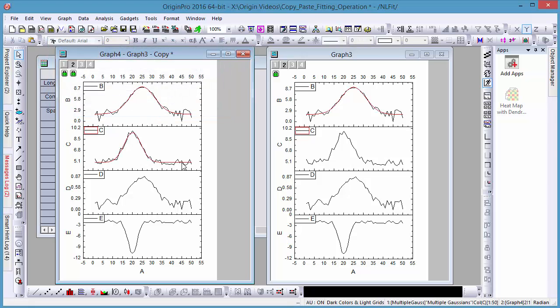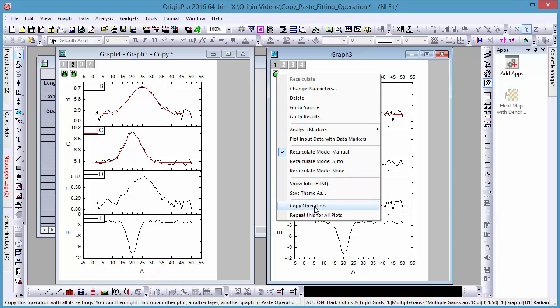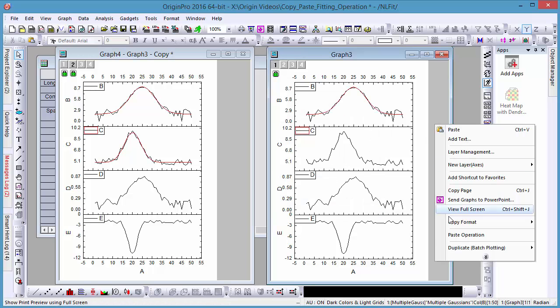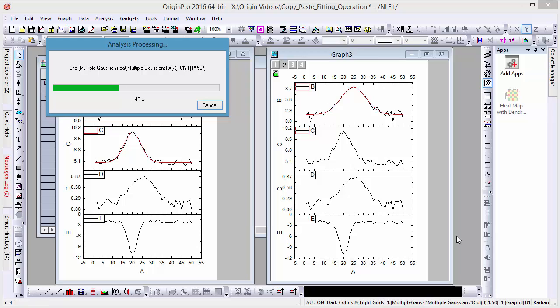To paste to all panels in the graph, make sure you right-click outside of any of the panel frames and do the same.